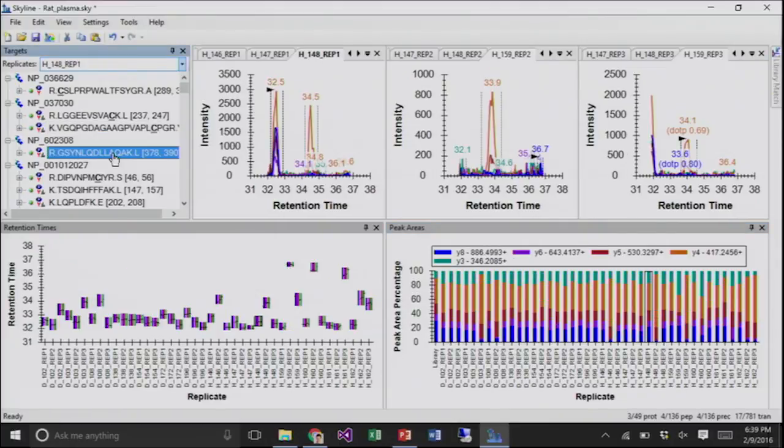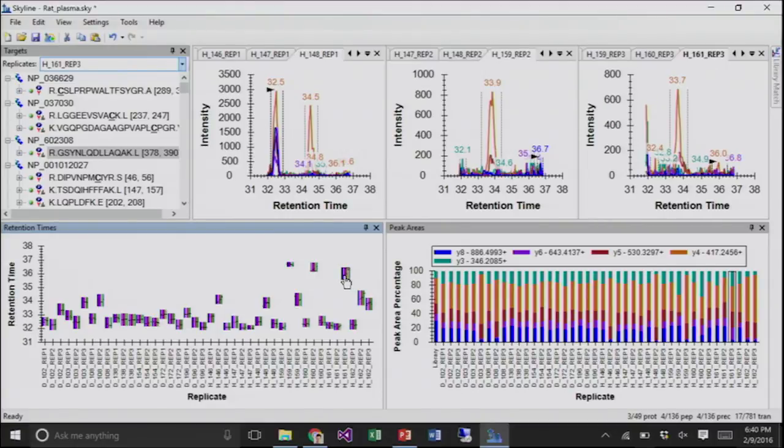Okay, so going on to the next one. Here are some problems. We might just say this is too problematic and delete it, but I think we can learn some interesting stuff from it. So if you were just going to correct this, where would you start? Anyone? Maybe on the right, with all these things which are out of retention time first. Okay, we can start on the right with the big retention time deviations, and we can just click on them.